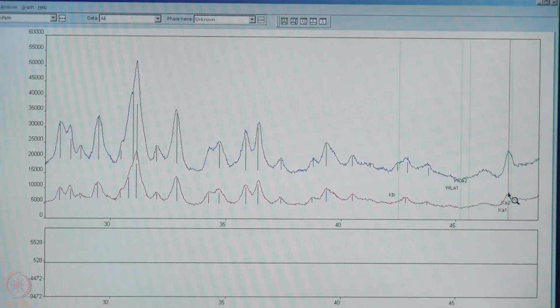So this shows that the presence of K beta becomes more and more significant for all kinds of peaks, from small angle to high angle, very weak reflections to strong reflections, and hence it will create problems in data indexing.